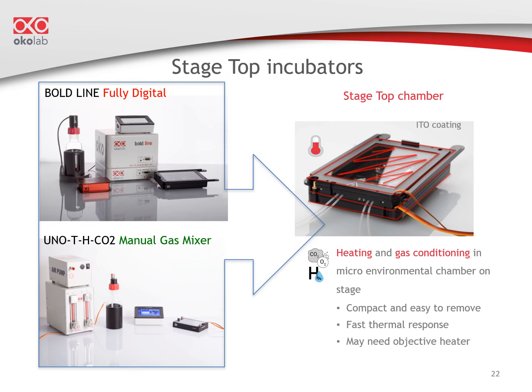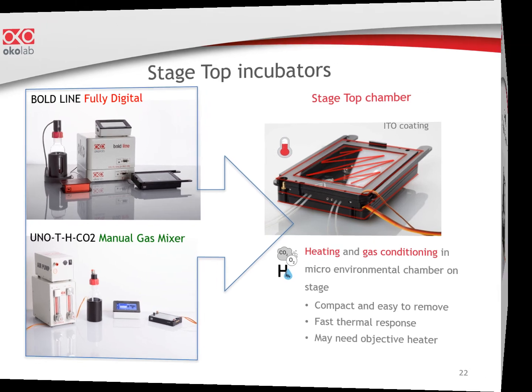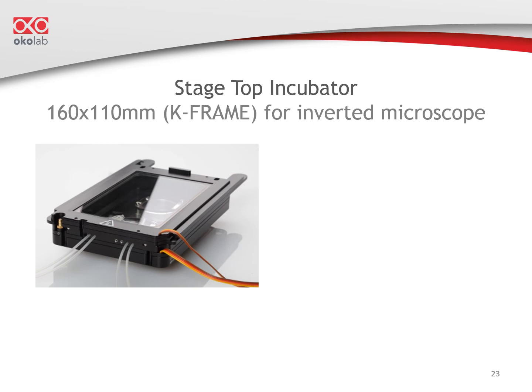I remind you that Bold Line and UNO are compatible with all Okolab stage top heating chambers. Let's see some common ones. To illustrate the chambers, I will use a K-frame as an example. A K-frame chamber fits stages with an opening 160 by 110 millimeters.